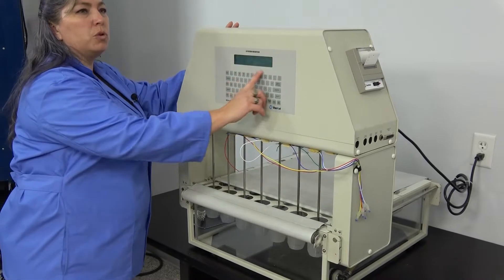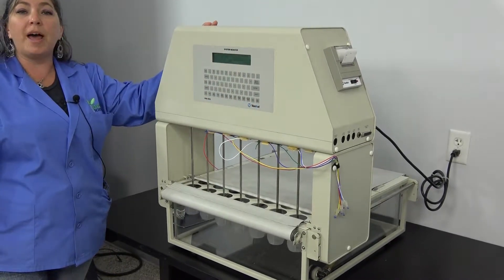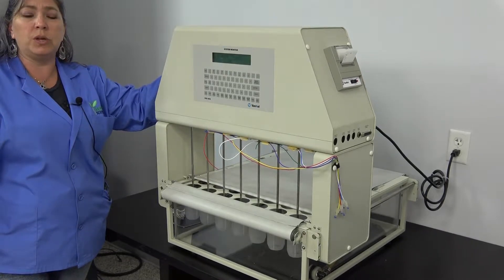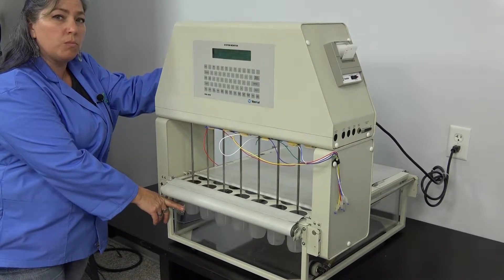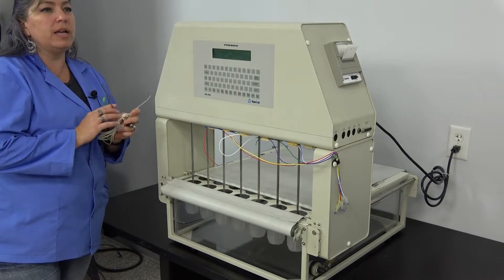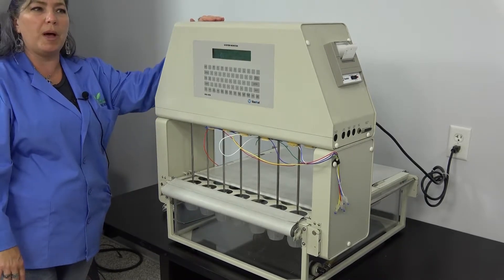It features a full QWERTY keyboard. You can get a hot water bath heater, a VK750D, to fit this unit, or you may want to get a chiller to hook up to it, or you may have one that will work with it. This particular unit is coming with the temperature probe, the communication cables, and of course the power cord.